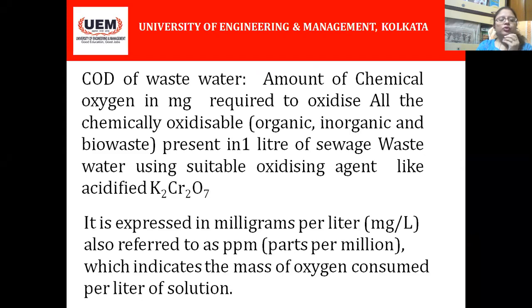COD is the amount of chemical oxygen in milligram required to oxidize all the chemically oxidizable substance that may be organic, that may be inorganic, that may be bio-waste, that are present in 1 liter of sewage wastewater using suitable oxidizing agent like acidified potassium dichromate. It is generally expressed as milligram per liter or ppm.